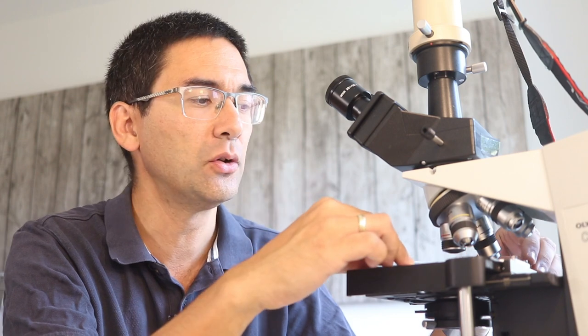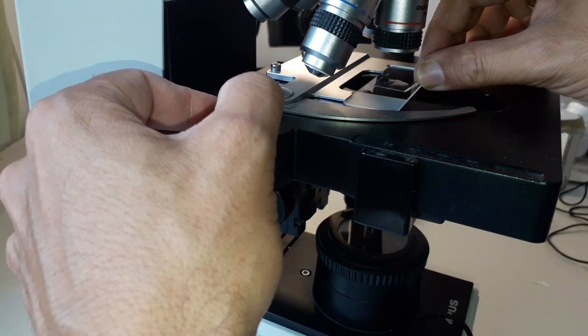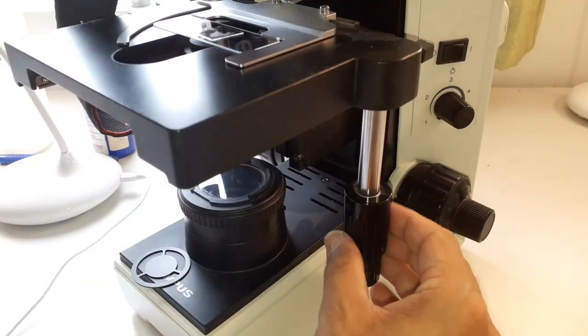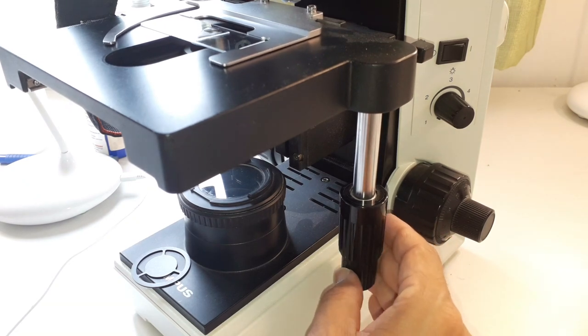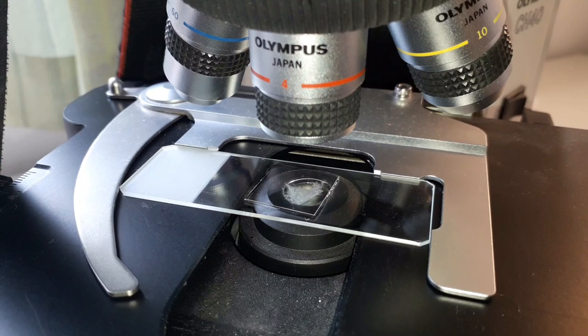So: condenser raised, aperture closed, filter in correct position. Now the slide goes in. Center the slide so you're not off to one side. Then turn on the light, turn up the light intensity, look through the eyepieces, and use the coarse focus knob to rotate the stage down until you see a sharp image.